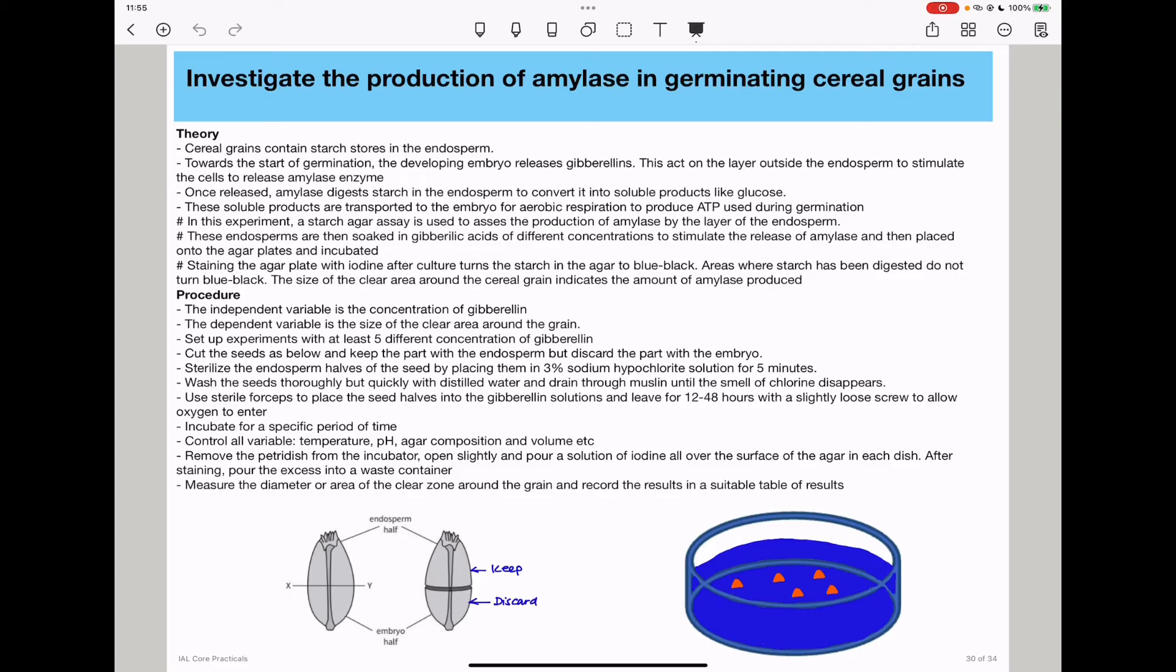Soak them for the same time, then wash the seeds thoroughly but quickly with distilled water. Drain through muslin until the smell of chlorine disappears. Use forceps to place the seed halves into the gibberellin solution and leave for 12 to 48 hours with a slightly loose lid to allow oxygen to enter.